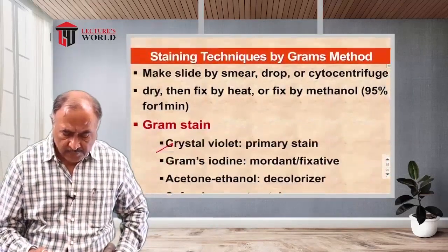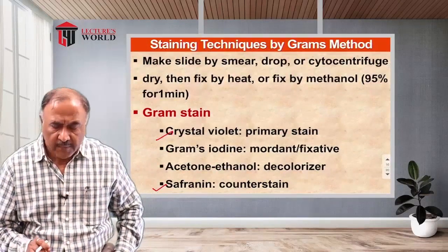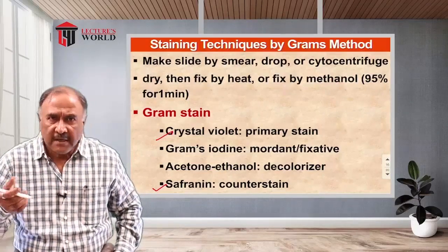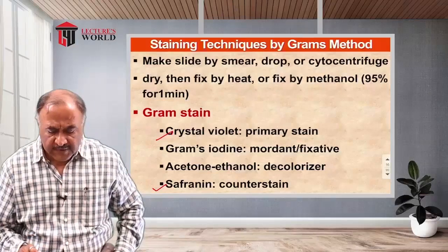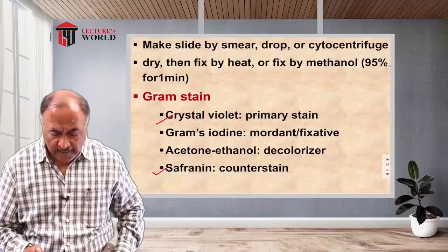Now the staining techniques used by different technicians basically follow a single line procedure. Most, or I would say all of them, first start by using a Gram staining technique.